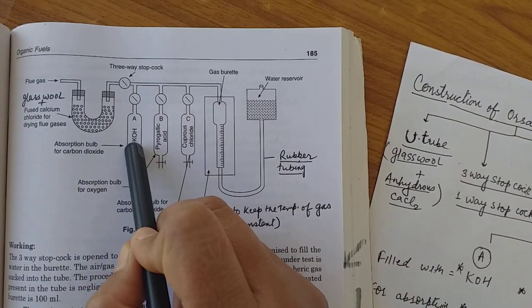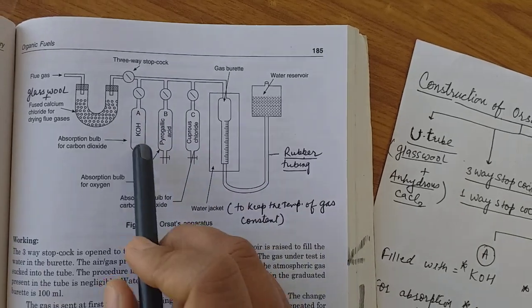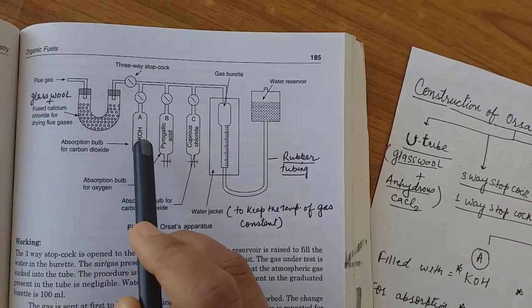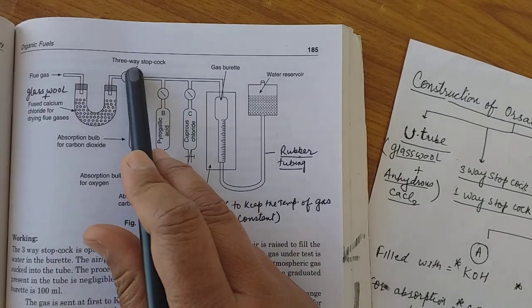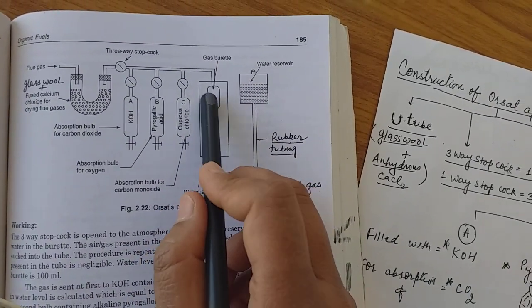Here KOH absorbs all the carbon dioxide that is present inside, and gas pressure decreases and the water level will decrease, which we will note.